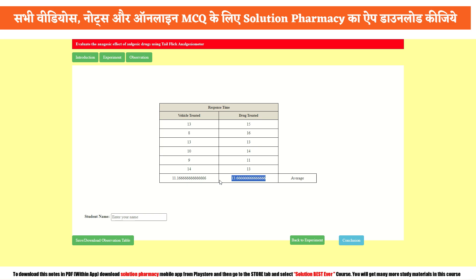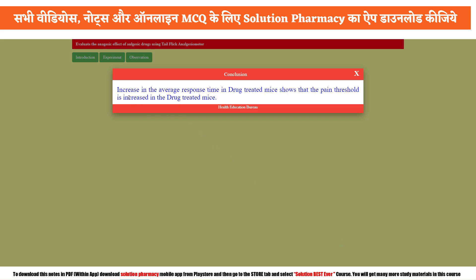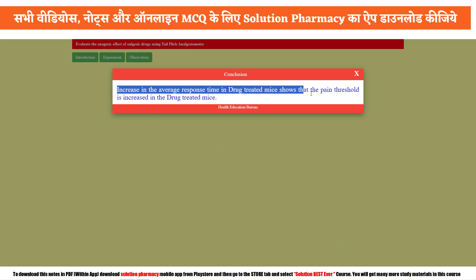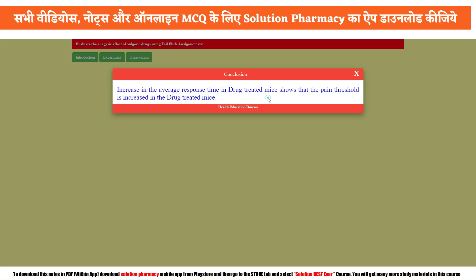Now click on the conclusion tab. The conclusion states: the increase in average response time in drug treated mice shows that the pain threshold is increased, meaning the given drug or plant extract sample was found to be analgesic in nature. That's all for today — it was a small but interesting practical. The Hindi version of this video is also available; please check the description box. Thank you and take care.